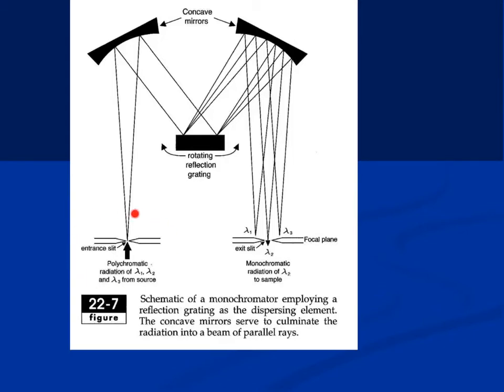This shows you how various wavelengths are filtered through. There is a source here which reflects the light, and then it focuses the light, and the various wavelengths are separated and focused. There is a filter or grating which lets only one wavelength through, in this case only lambda 2, which may be 540 nanometers or 750 nanometers. So it moves to let lambda 3 go out, or lambda 1, or lambda 2. So these are all the wavelengths possible, and they are just filtered.